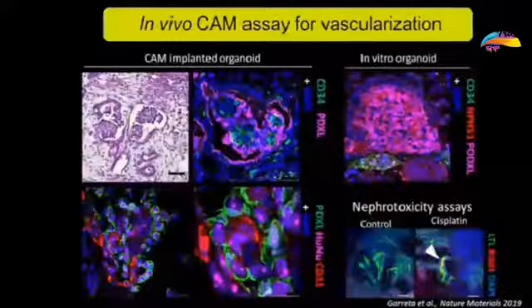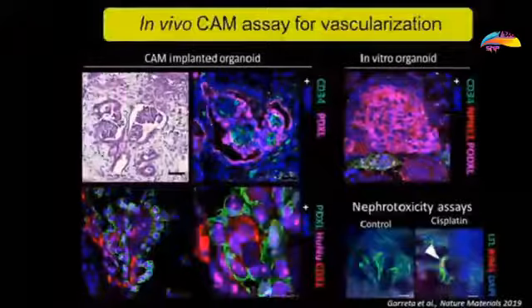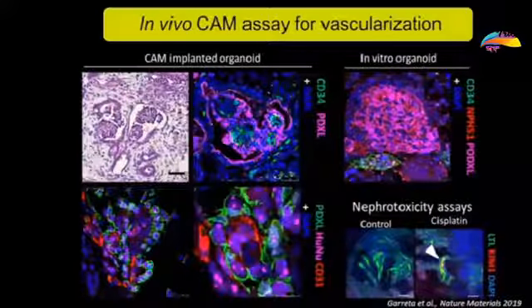We took advantage of kidney organoids to further perform nephrotoxic assays and also as a platform.